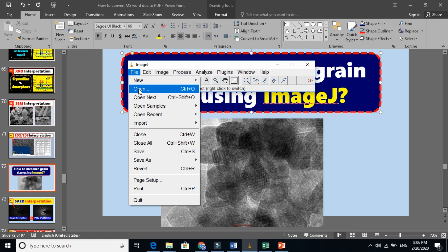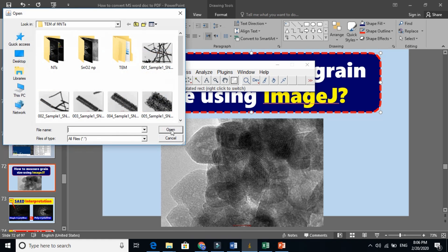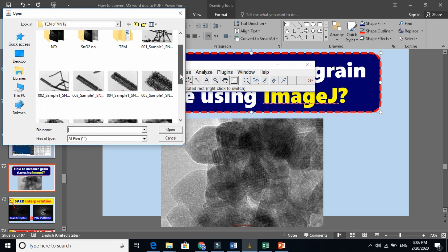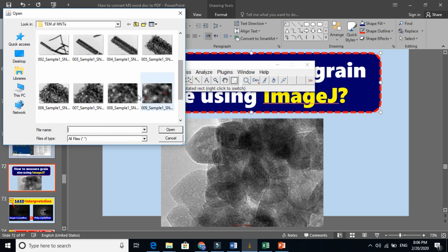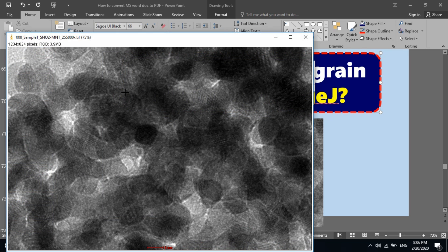Go to file, click open here. And I want to import this image here. You see, now it is open here.